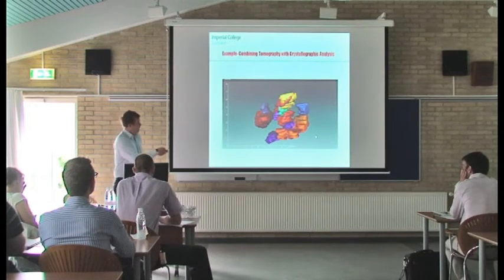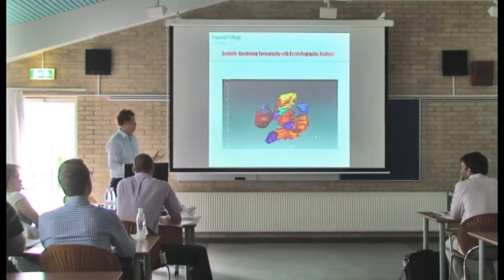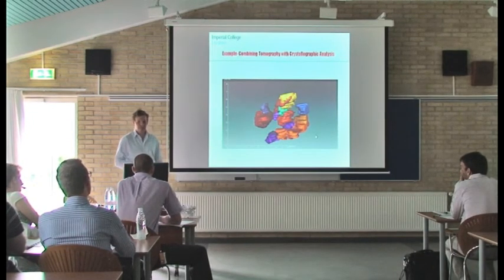But nice things you can pick out, so you can see a twin boundary running through a nickel grain there. So there are some interesting things, and also for perhaps different materials, it gives you a bit of phase contrast as well, and that's difficult to come by.